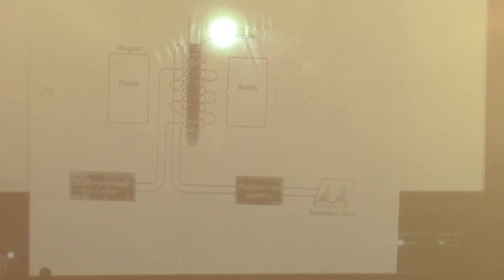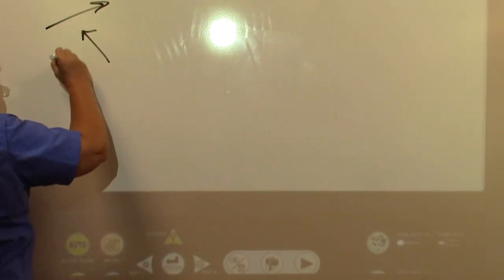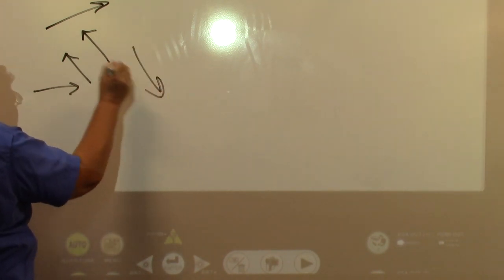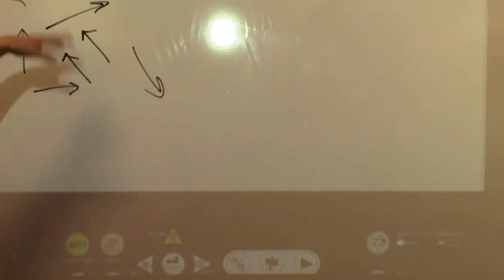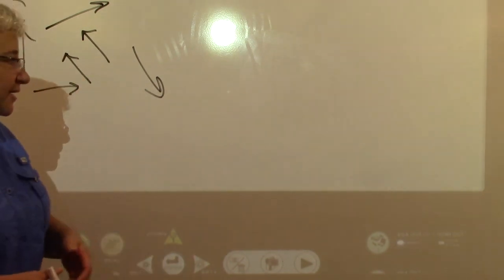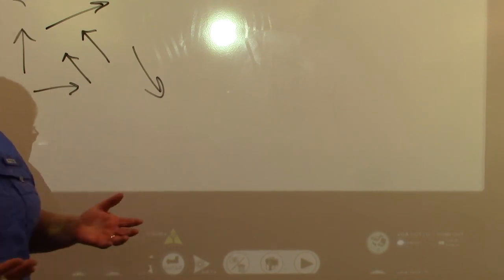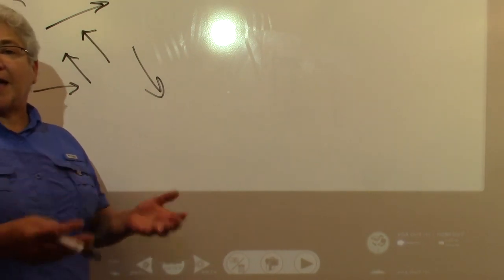All right, so we're not going to do a lot of theory, but we do need a little bit of theory. When you have nuclei in your sample, if you make your sample up in the lab, these arrows represent the nuclear spins of the atoms.